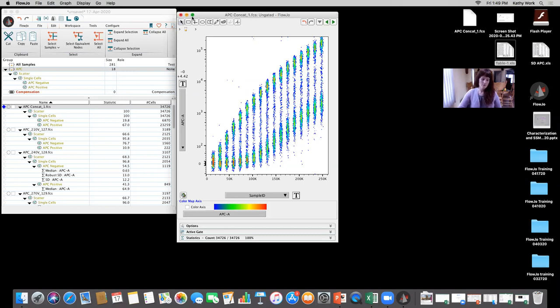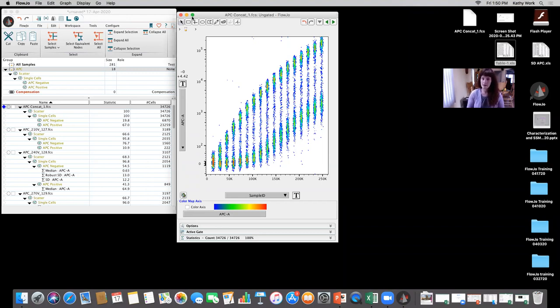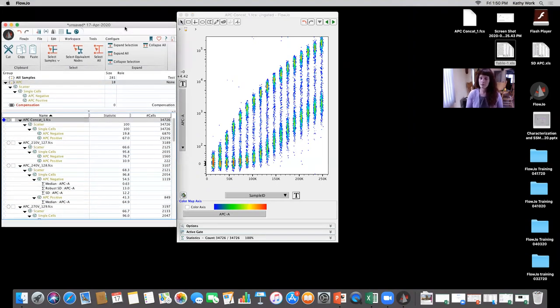Next we're going to go into determination of the spillover spread for the instrument with the fluorochromes in the CD4 kit. That's fluorochrome-dependent. So just because we're characterizing these PMTs, you're still going to have to optimize your panel, but you have a nice starting point. If the fluorochromes used for the CD4 walkup line up with your panel, you'll get a nice idea of the spread and smart panel design you can utilize. Are there any more questions before I move forward to that?